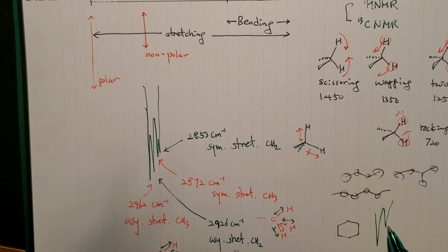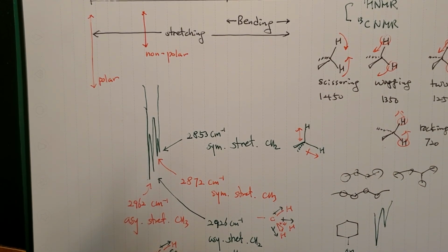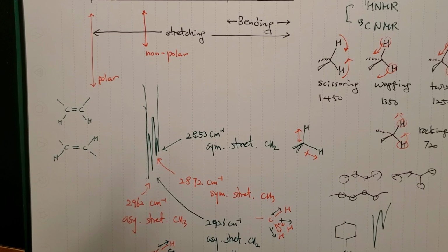2900 and then the lower end of the 2800. And if you happen to have some attachment, like, I don't know, OH or something, then you have CH, there could be some additional small peak here or here, you know. So you can expect the shape change around the 2900 to 2800 range for sp3 CH.